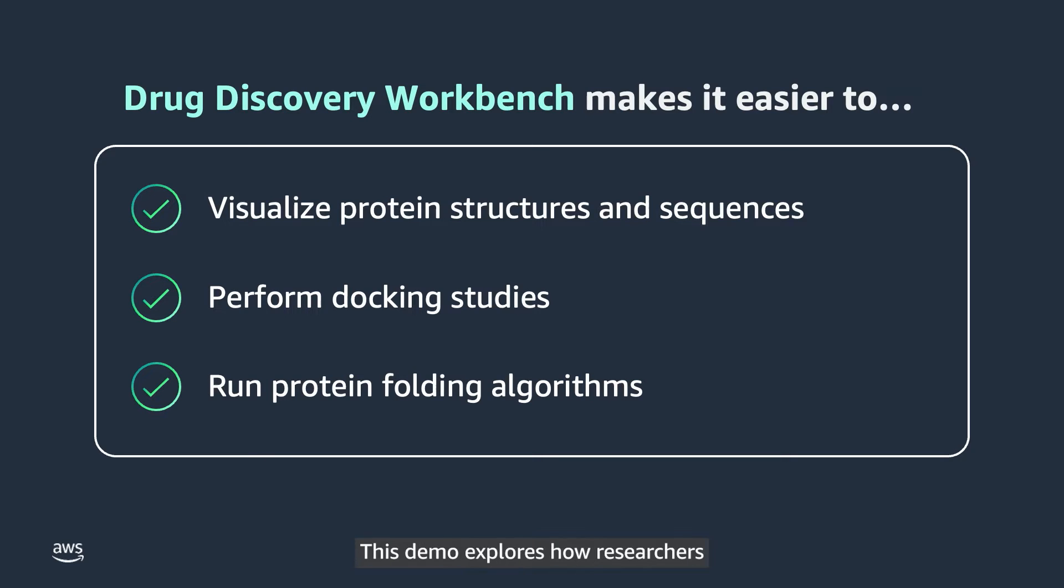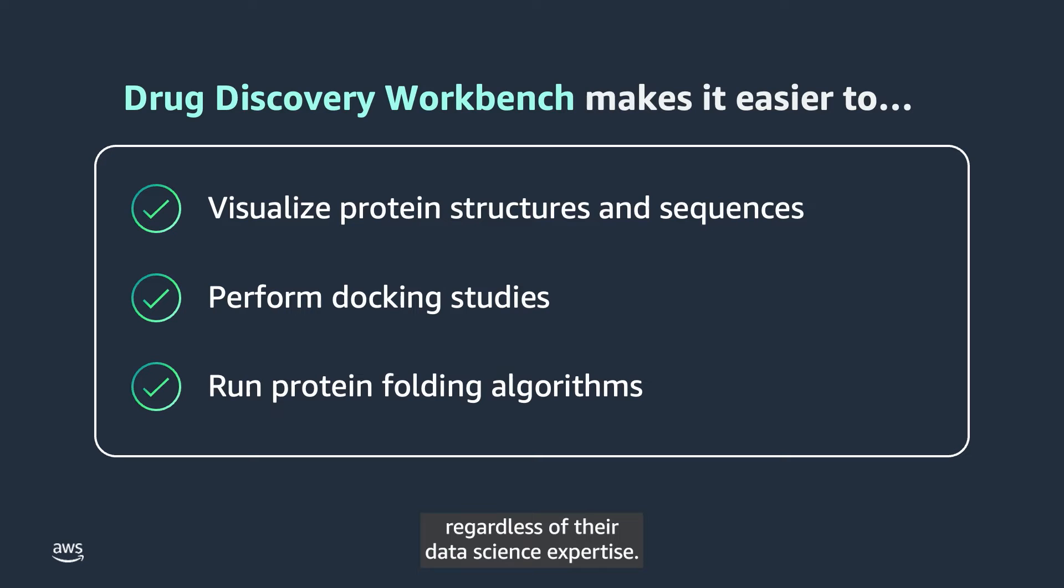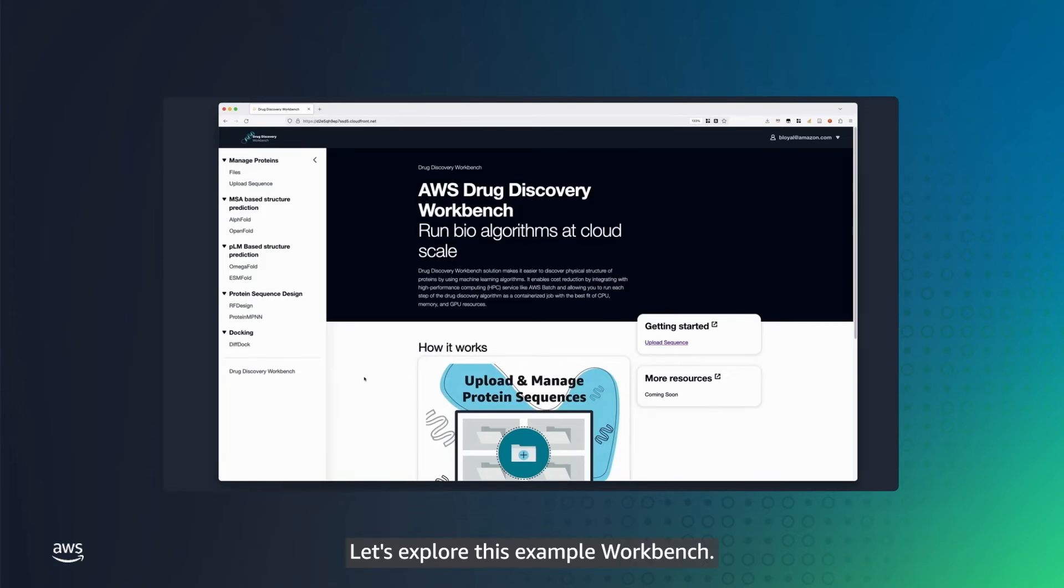This demo explores how researchers can easily run and compare results regardless of their data science expertise. Let's explore this example Workbench.